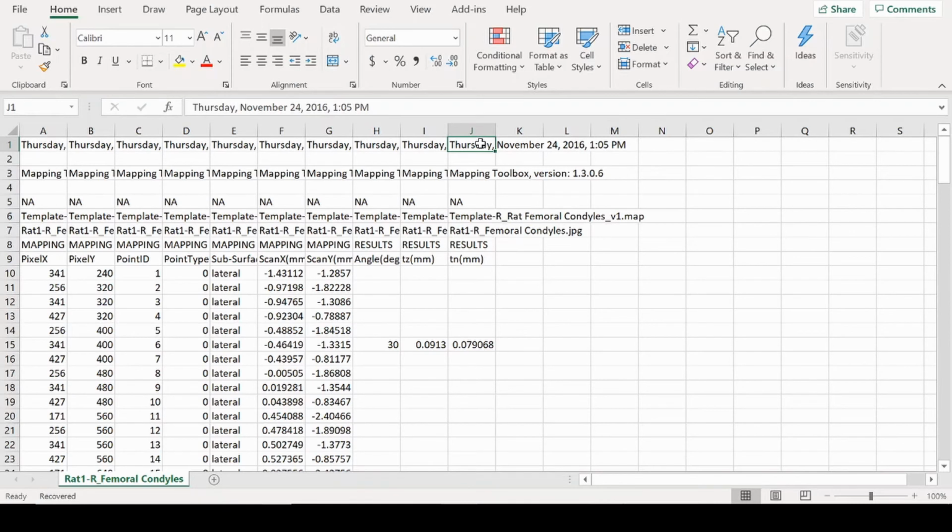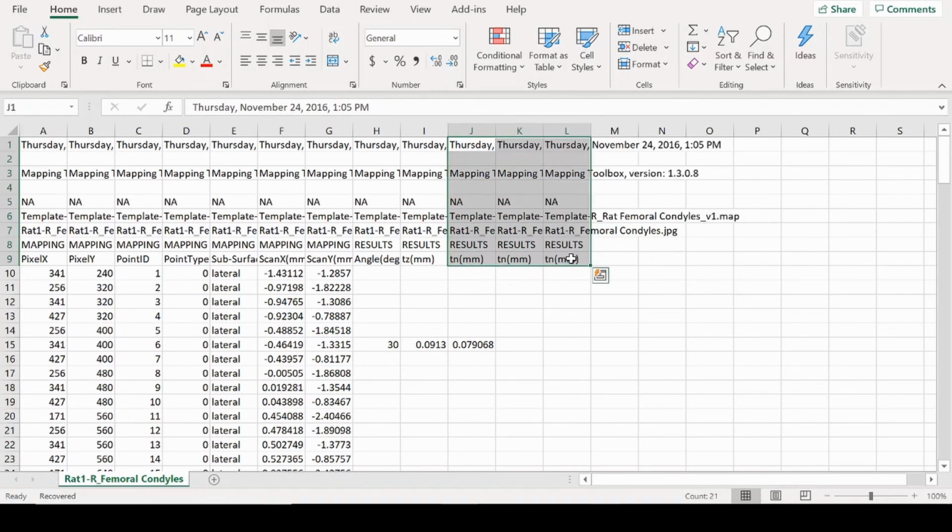Now you must open the previous results map file generated in Excel. As done earlier for the sample thickness, copy and paste the header columns for X number of characterizations. In this case, I would like to obtain the Young's modulus in megapascals and the elastic fit mean squared error or MSE.